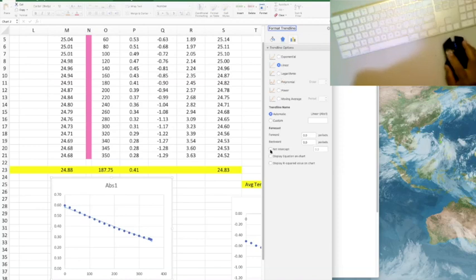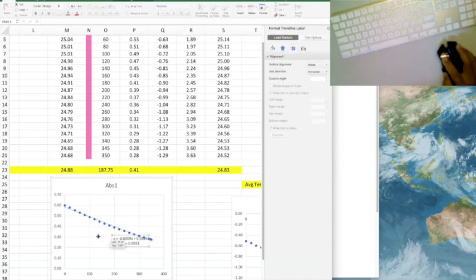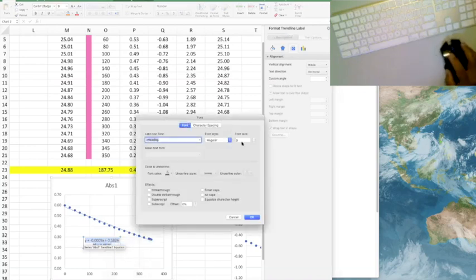You don't want to set the intercept. You don't want the origin to originate at 0, 0. Definitely not 0, 0 here. But I do want the equation on the chart and the R squared. R squared will tell you how well these data points fit that line. And right now, you can see the correlation factor, if you look real closely, let me go ahead and highlight this, right click, make that font larger.